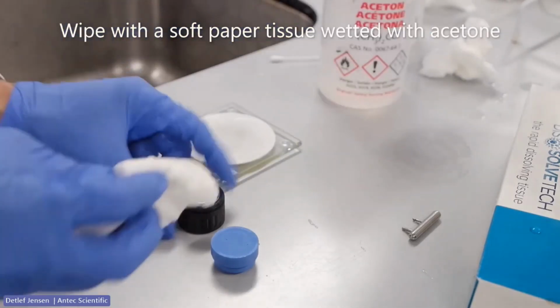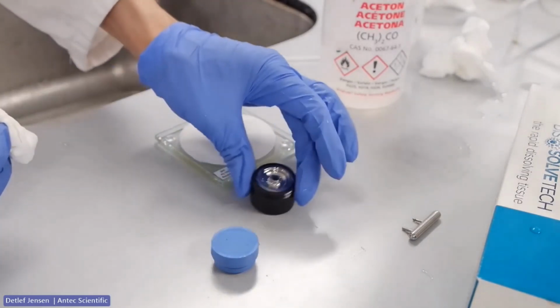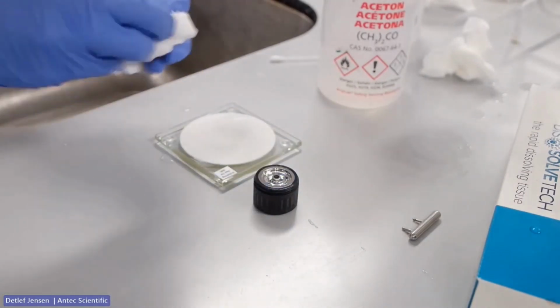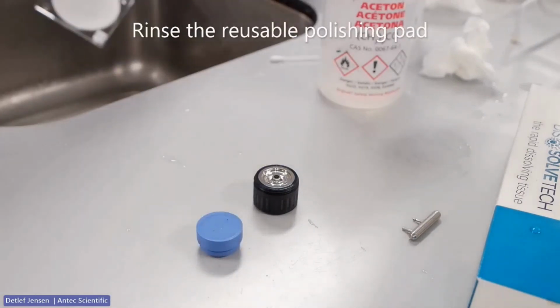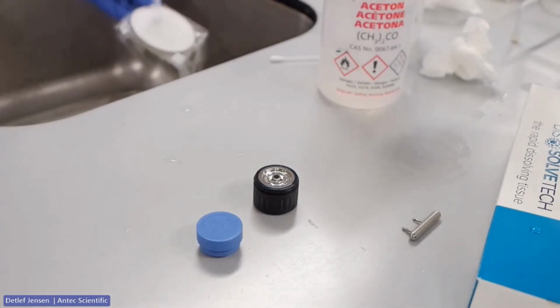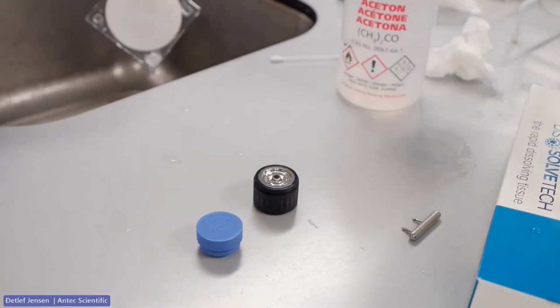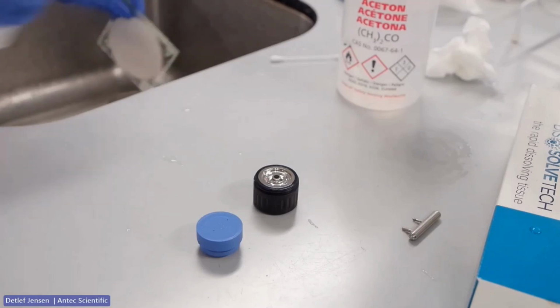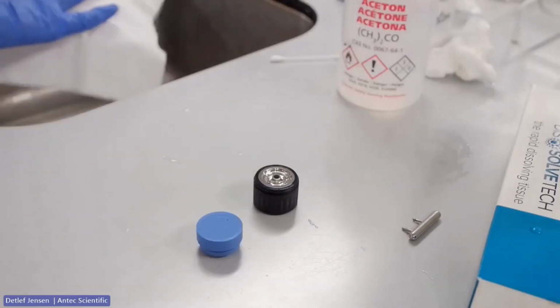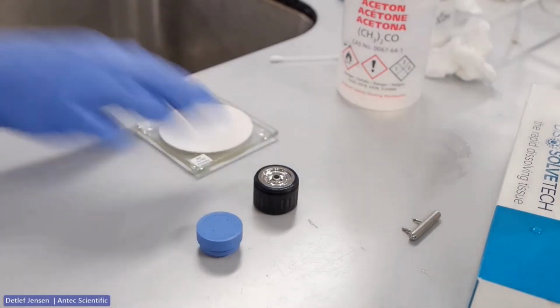Clean the surface with an organic solvent like acetone. And don't forget to rinse the reusable pad. Tap water and now deionized water. Ready to go?